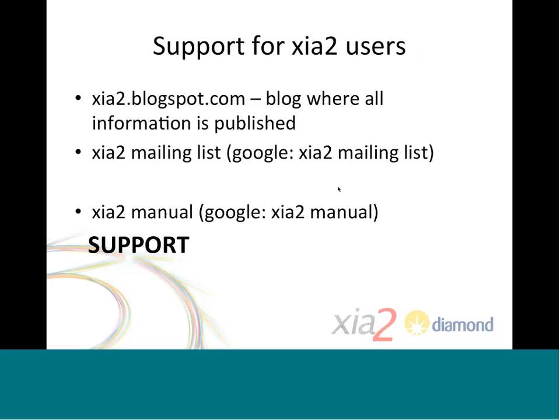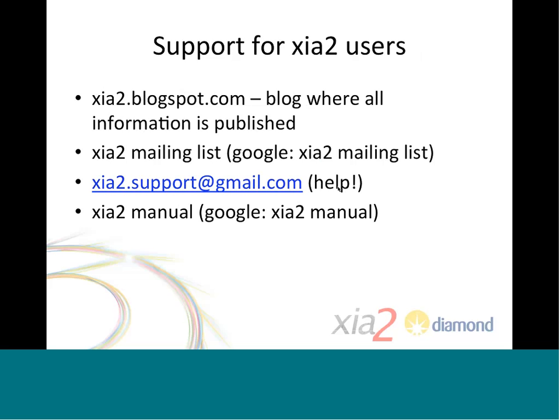In terms of support for XIA2 users, I would always suggest that you take a look at the blog because that's where I write things that are happening with XIA2, where I publish releases, where I publish when there's known problems or issues with a new CCP4 release and so on and so forth. There is also a mailing list, which if you Google XIA2 mailing list, you'll find. That's got fairly low traffic and it's a great place to ask questions.